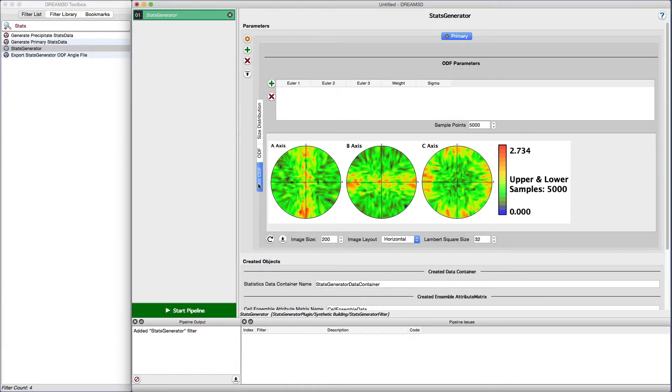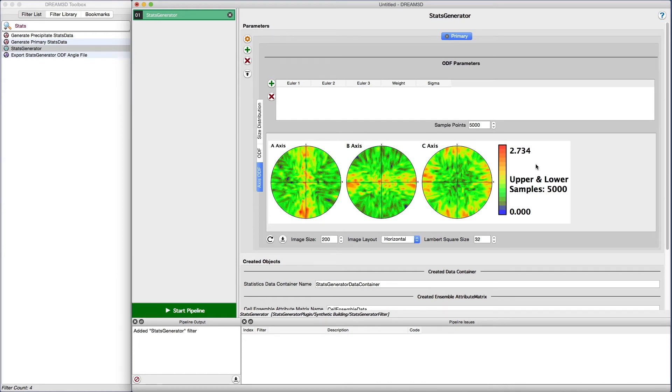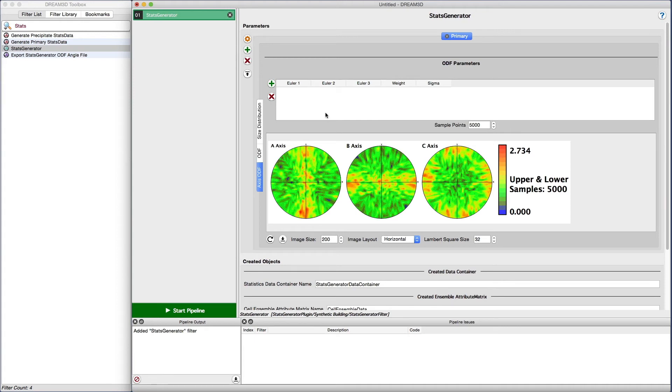The last option is the axis ODF, which controls the morphological orientation of the grains. Since we are creating an equiaxed polycrystal, this set of parameters will not have much effect on the final structure. Where the axis ODF comes into play is if we are generating a rolled microstructure or a composite structure that has long fibers or other elongated features. The axis ODF will control how those features are oriented in space.